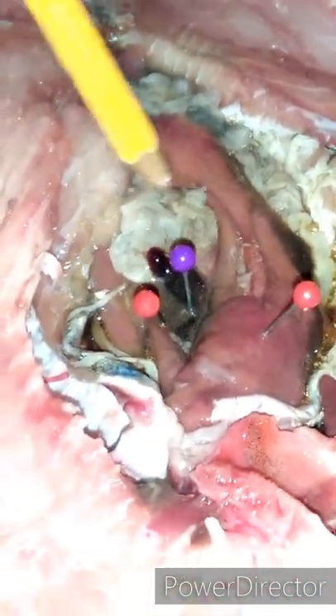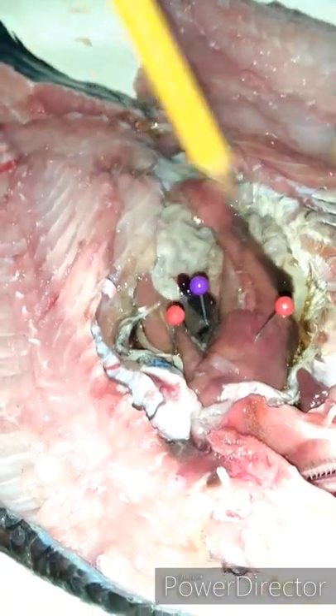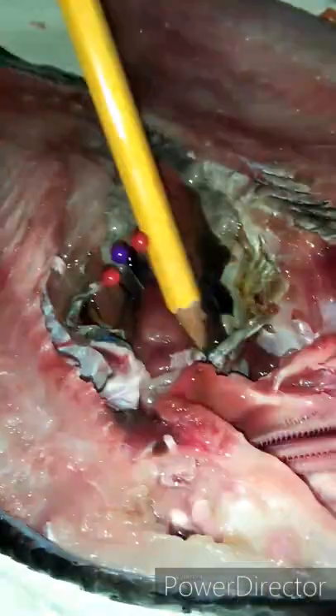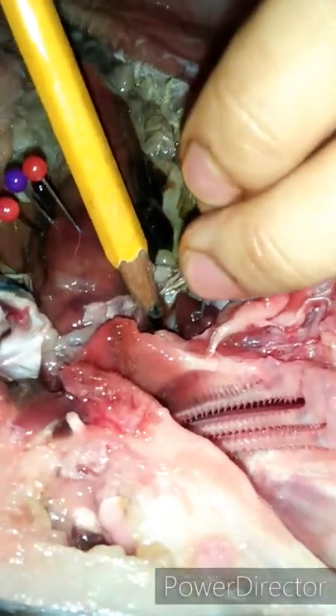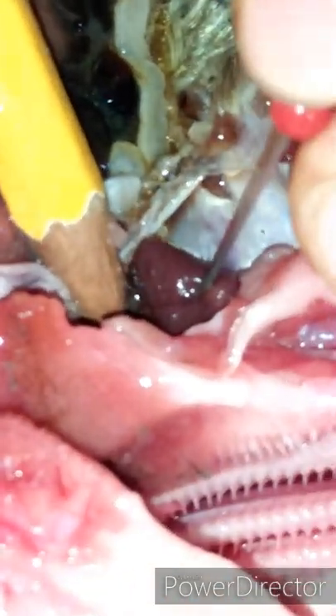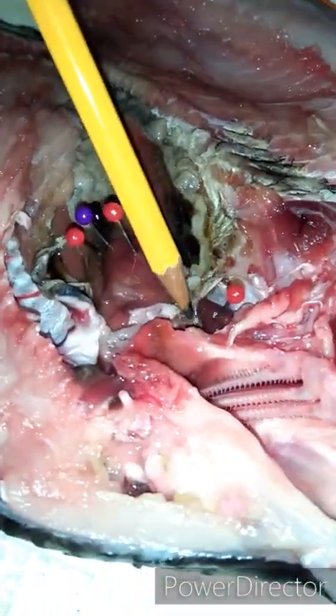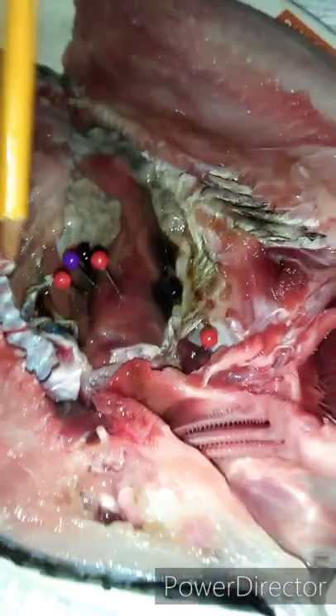Now we're going to locate the heart — this is the heart. The heart circulates blood throughout the body. This is where the heart is located.